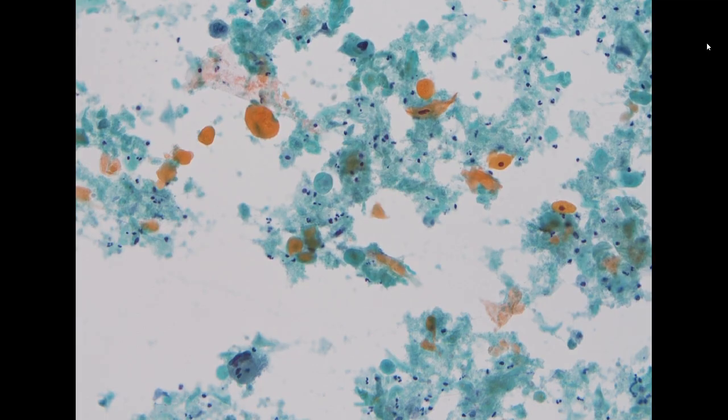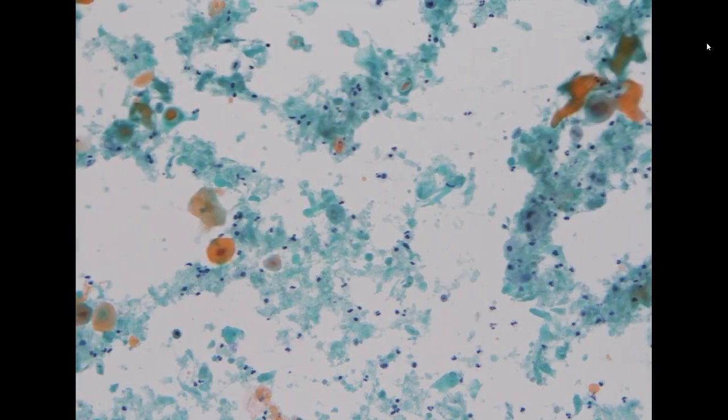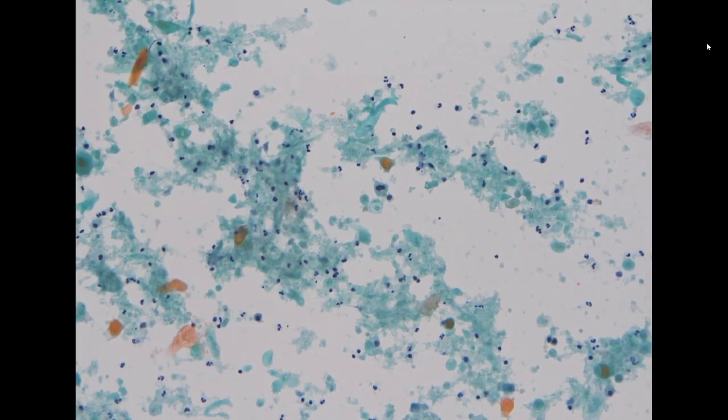But in this case, this is unusual, we see mostly single cells with well-differentiated keratinized cells. This is not very common that we will see something like this. So this is from the patient's pericardial effusion.